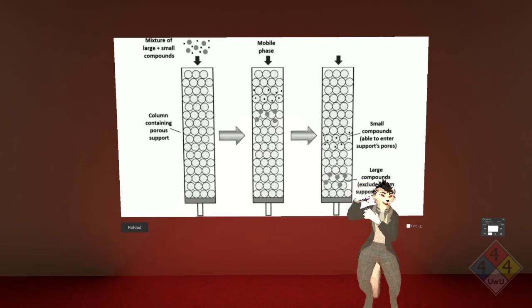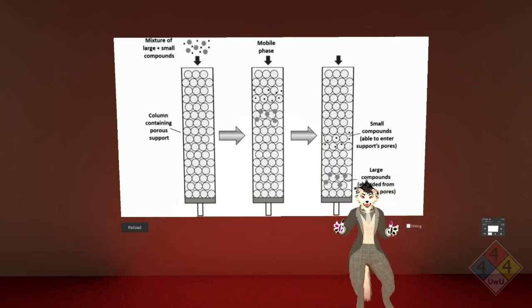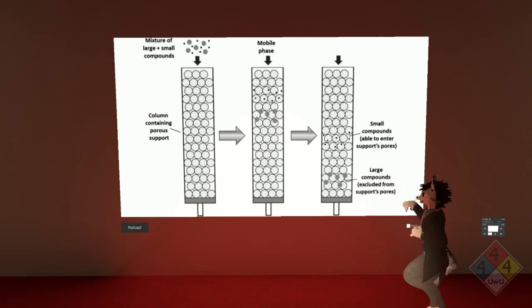And once you have them separated out, much like looking through a magnifying glass, you're looking at individual components instead of a singular blob of everything at once, which really helps if you want to quantitate and have a measurable idea of what's in your sample, instead of a vague idea of like, yeah, that's like D8, right? Totally. Science is built on stuff more than vibes. We need to actually get numbers.